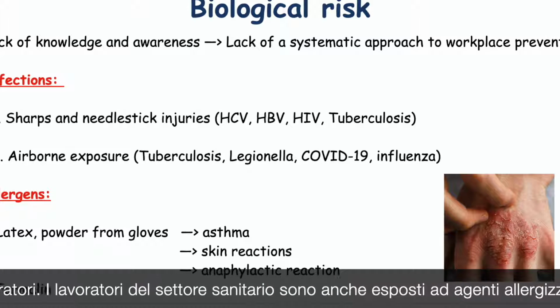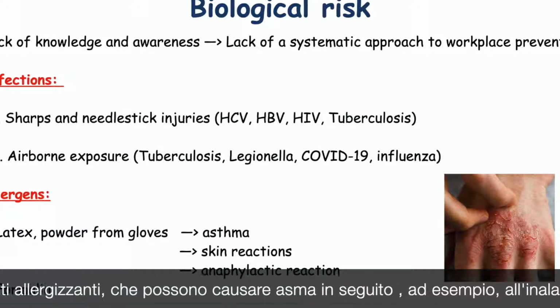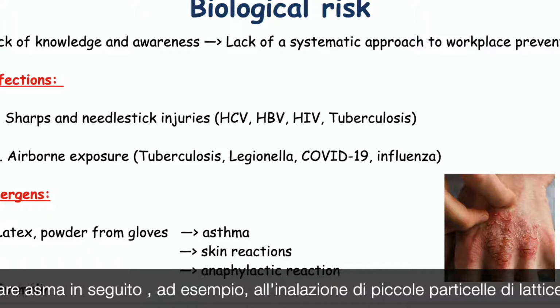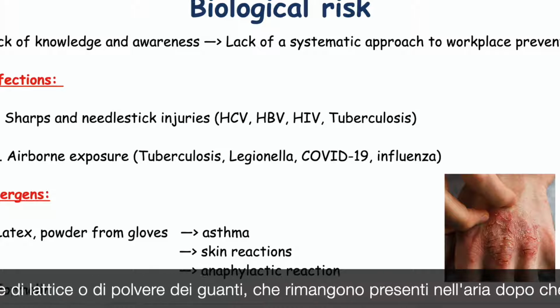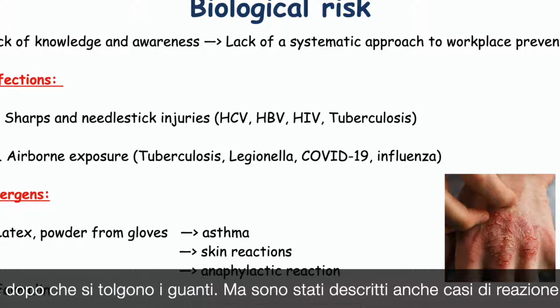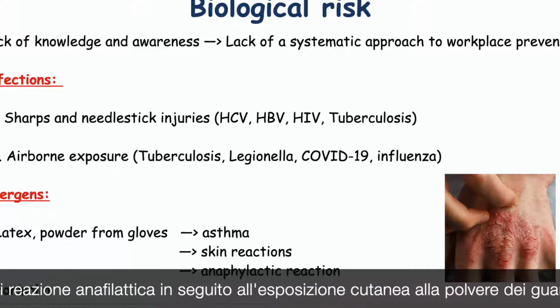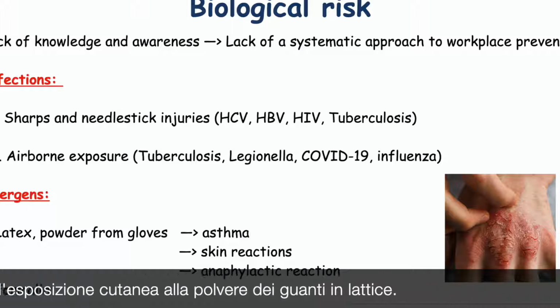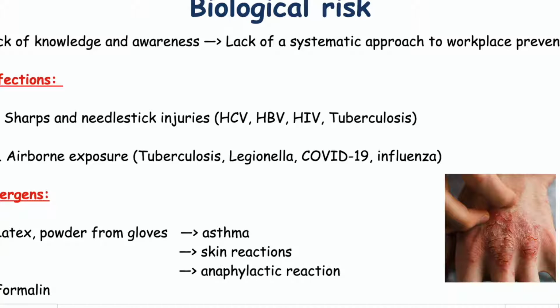Workers in the healthcare sector are also exposed to allergenic agents that can cause asthma after inhalation of small particles of latex or powder from powdered gloves, which are present in the air after, for example, removing gloves. But cases of anaphylactic reactions as a result of dermal exposure to dust from latex gloves have also been described.